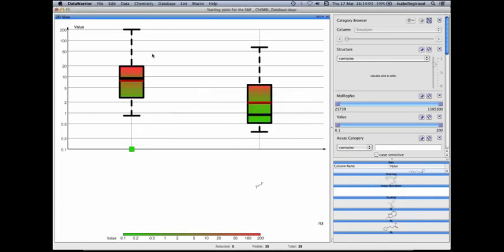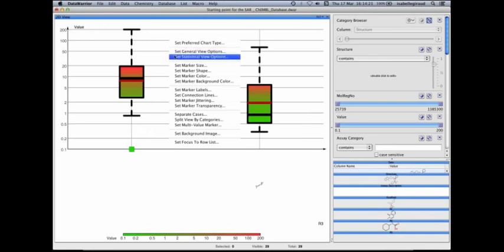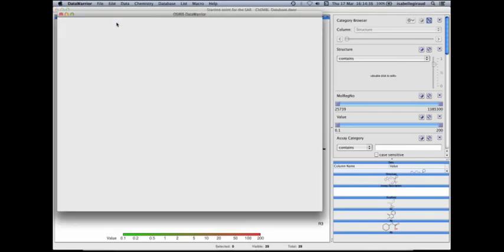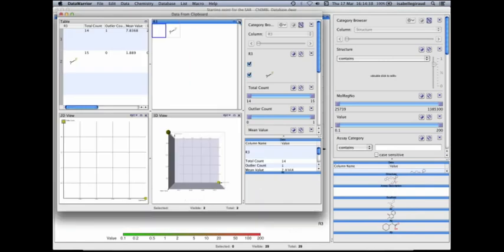So with this kind of plot, you immediately see the distribution of your data. The average is represented with the red line and the median by the black line. There is no numerical value of this median and average, so either you will display them by changing the statistical view option, or more easily you just copy these statistical values that are there in the plot but not visible. So now they are in the clipboard, and you go on Edit, Paste, and here they are.